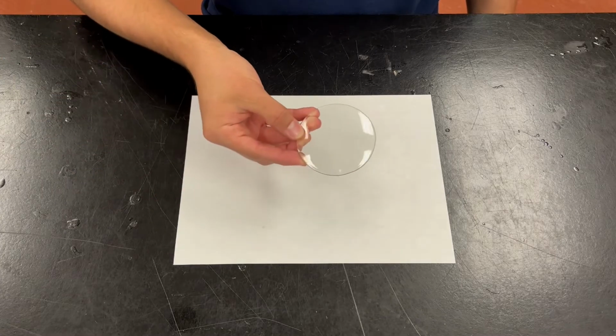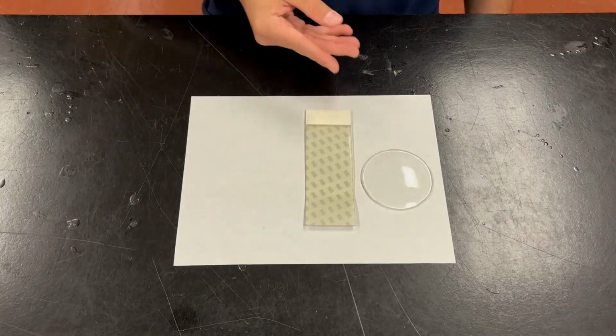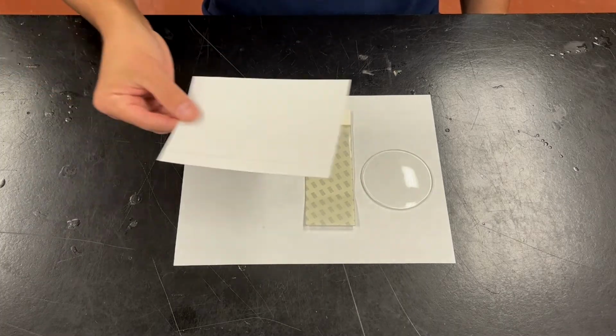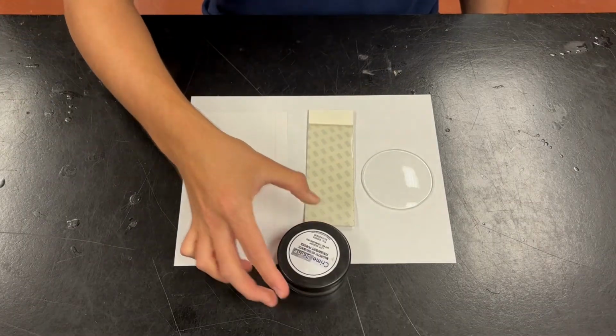To collect fingerprints this way, we will need a non-porous surface where the fingerprint will be created. Collecting tape, as always. A surface that offers a contrast to transfer the fingerprint. And magnetic powder, which will require a magnetic brush.